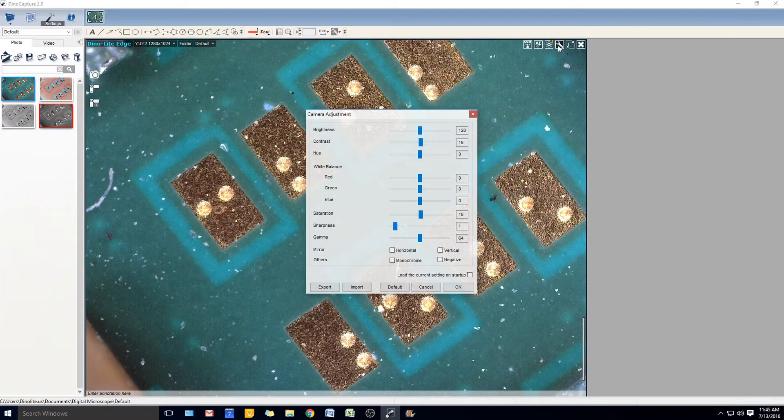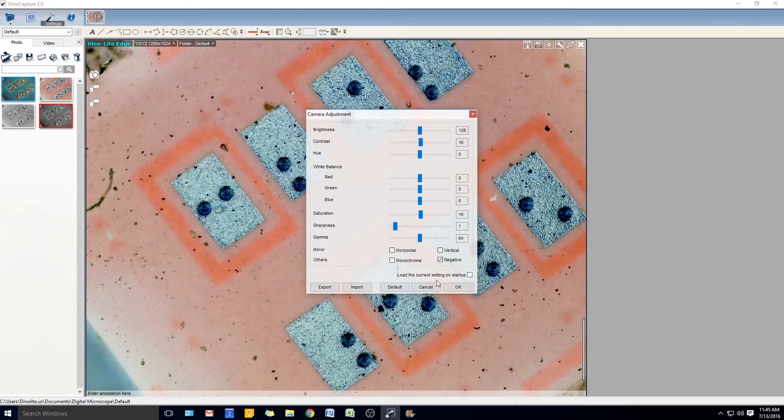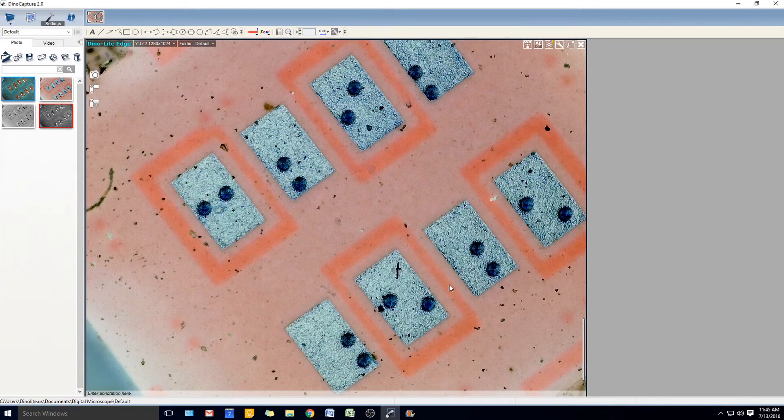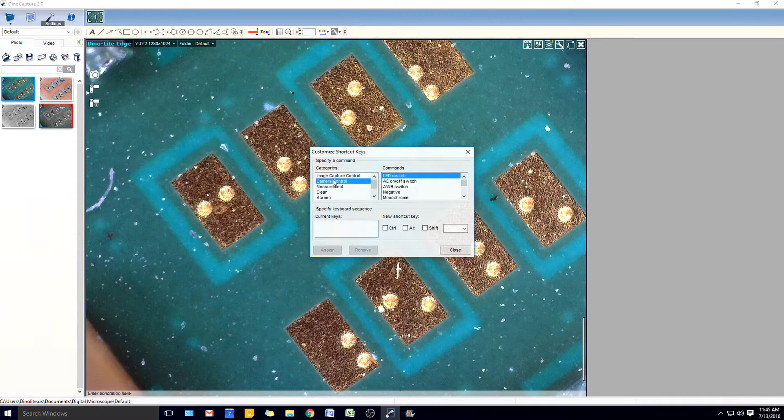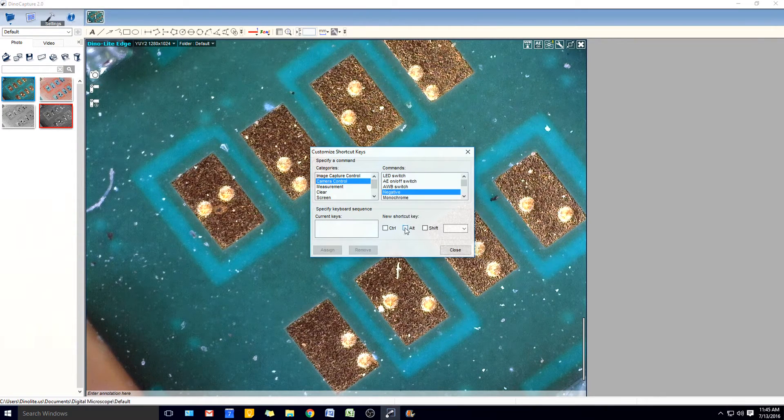Users who constantly switch from negative to normal viewing modes used to have to go to the Settings to open the menu and check the negative box each time you wanted to alternate viewing.